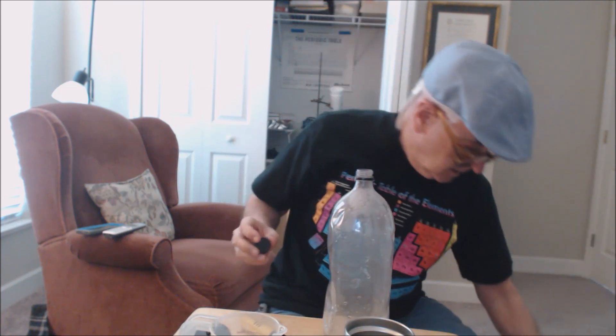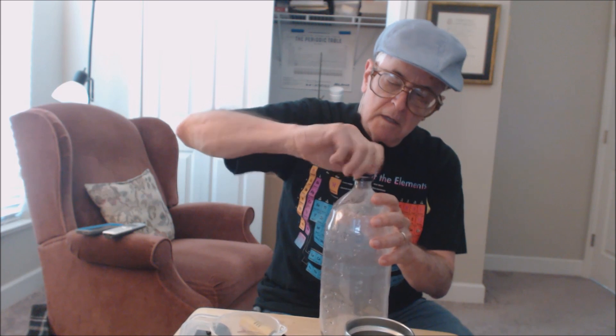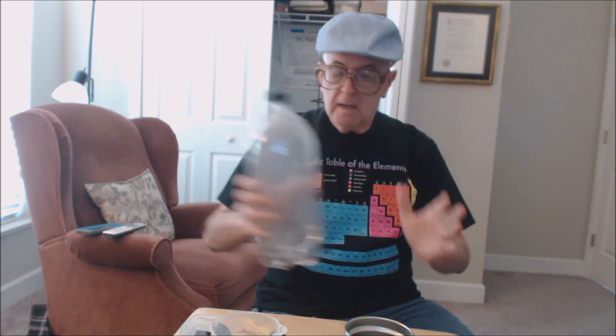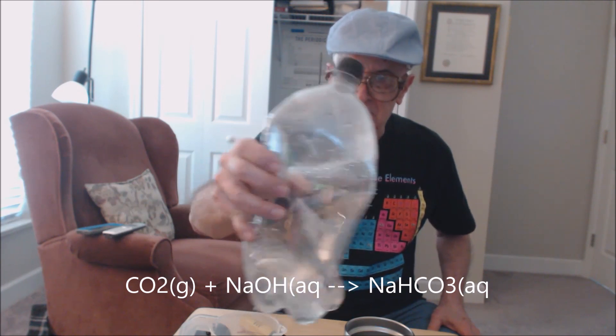Put the cap on nice and tight. It's making a lot of crackling sound, and as the carbon dioxide gets absorbed, it's changed from gaseous carbon dioxide to sodium bicarbonate when it reacts with the sodium hydroxide.